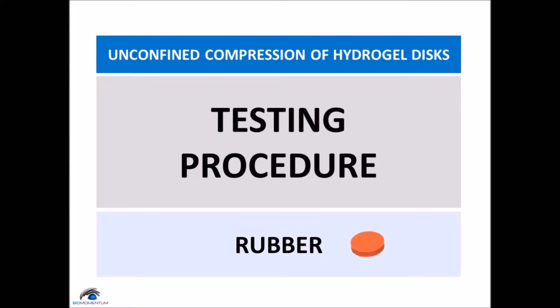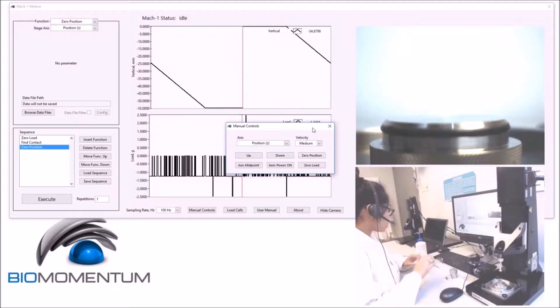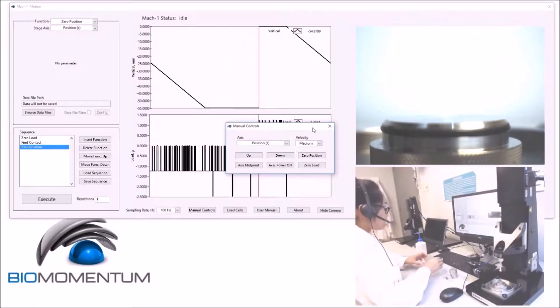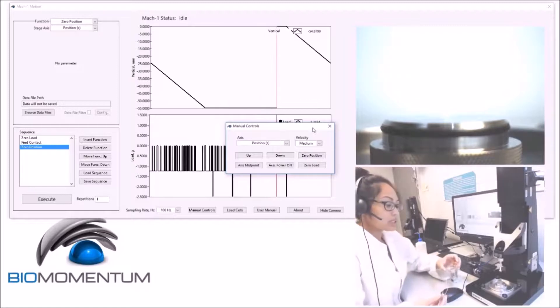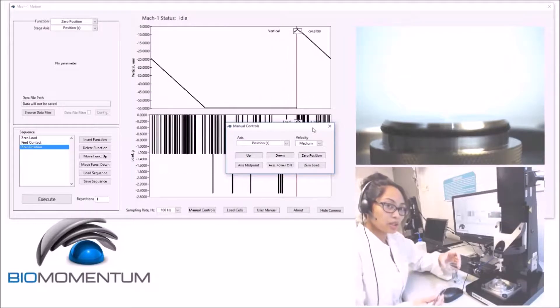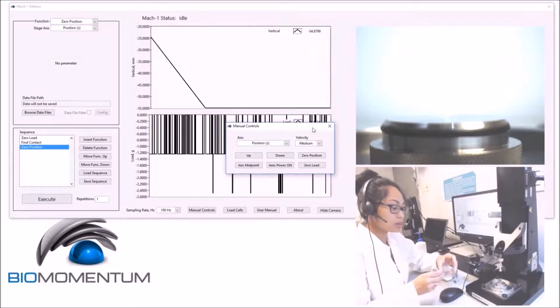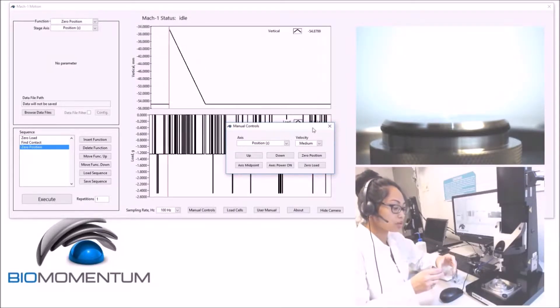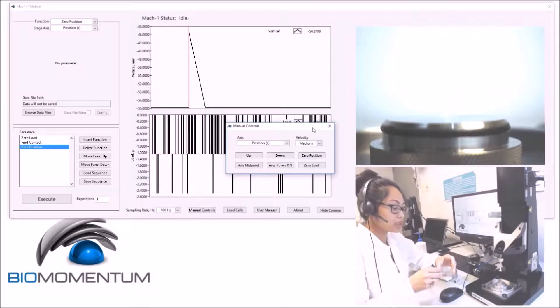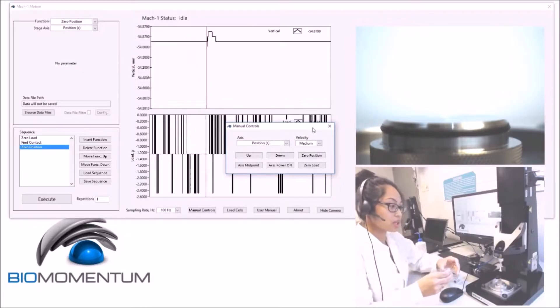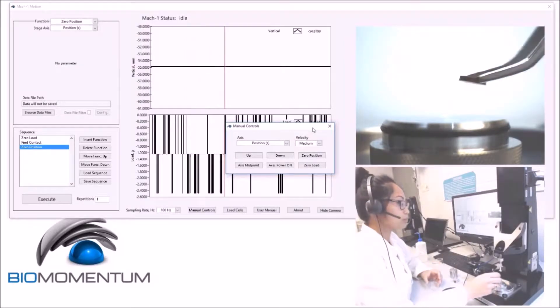And now, the testing procedure for the rubber sample. Place an 8mm disc-shaped rubber sample in the center of the sample holder.